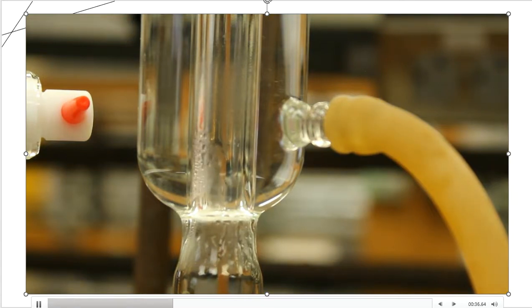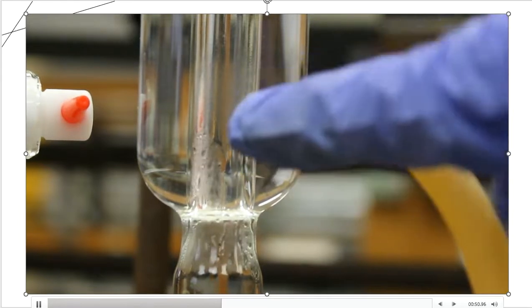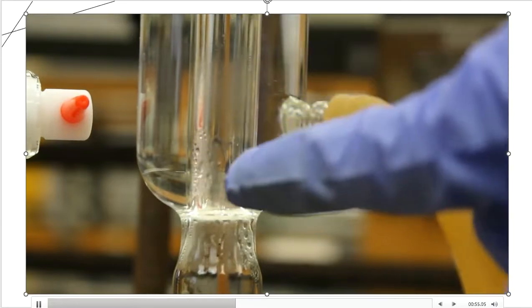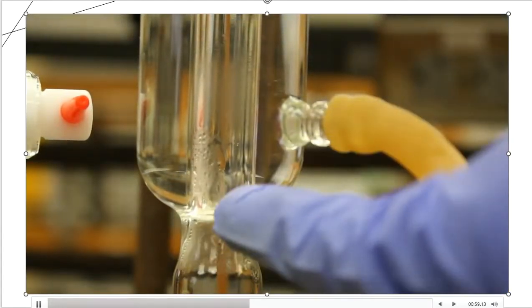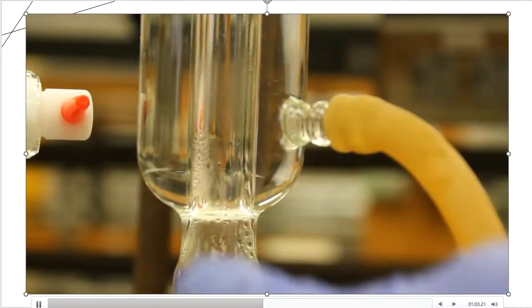So that's just one thing I want to point out. As a laboratory person, this is something that I would monitor and make sure that it's not getting out of hand. So condensation's good. I see the ring that's basically right here. You can see the cloudiness there, some clear here at the top, and then you can see all the droplets that are beginning to happen down here at the bottom. All of those are product droplets that I do not want lost. So all of these are dripping back down into solution.